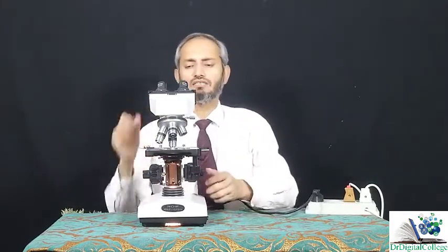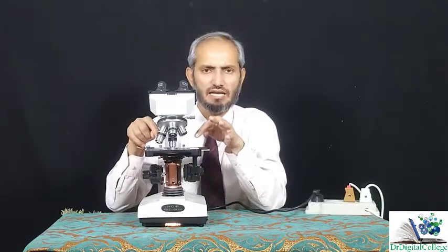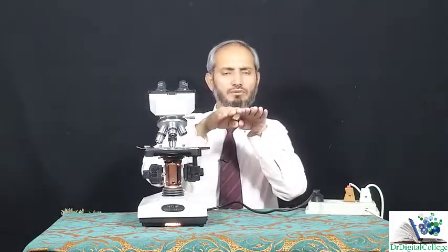Now, look at this. If you are observing from here and you are moving your stage up, you are not directly observing your slide. You are observing through your eyepiece lenses. Now, unintentionally, or because of lack of practice, your stage will move too far up and this objective lens will hit the slide and the slide will be broken, tick. So there is the loss of this slide.